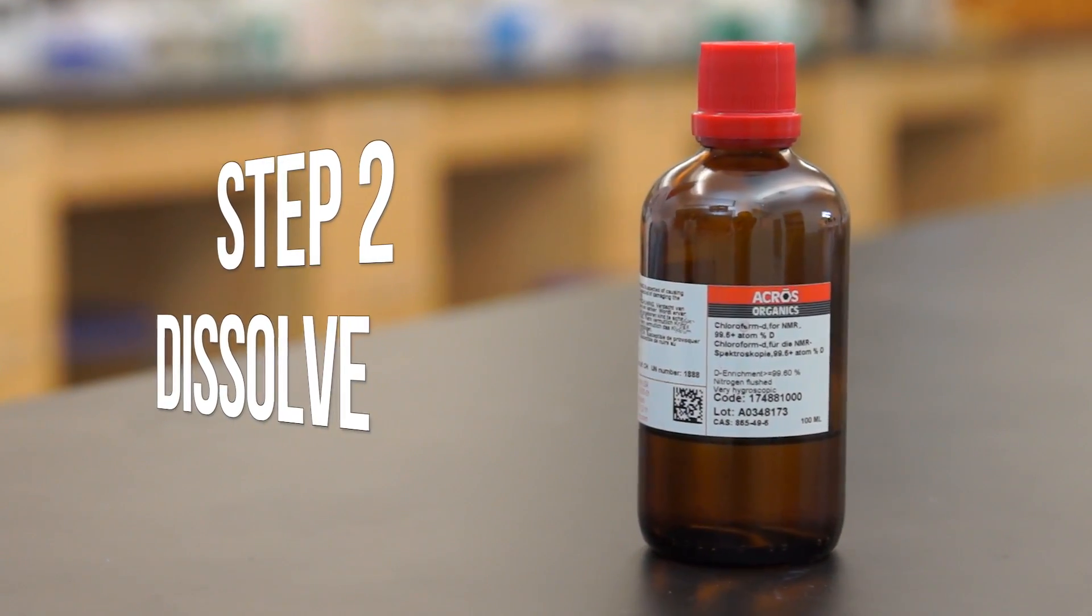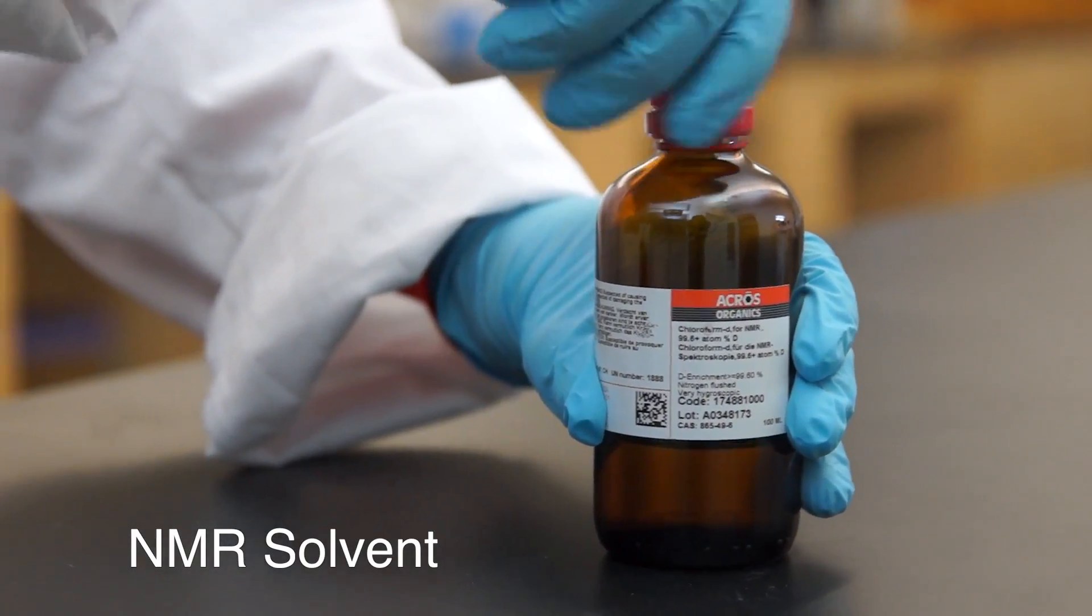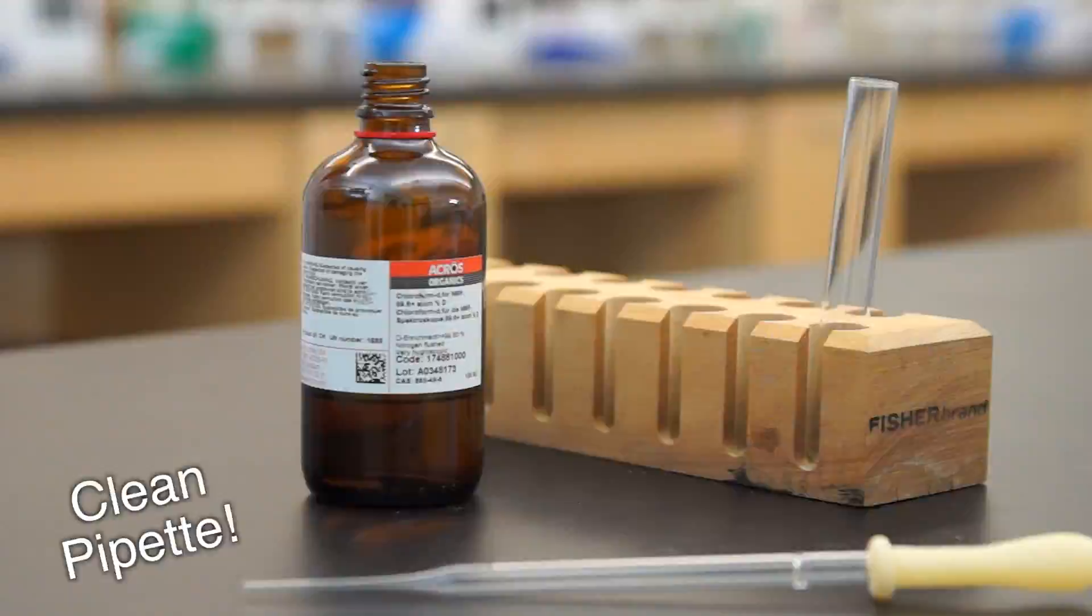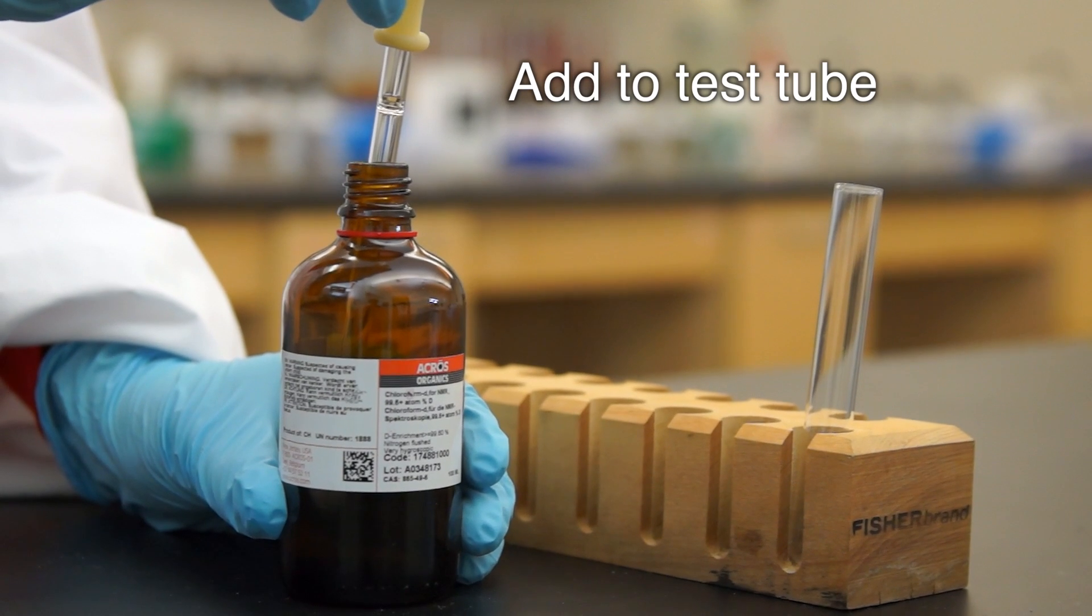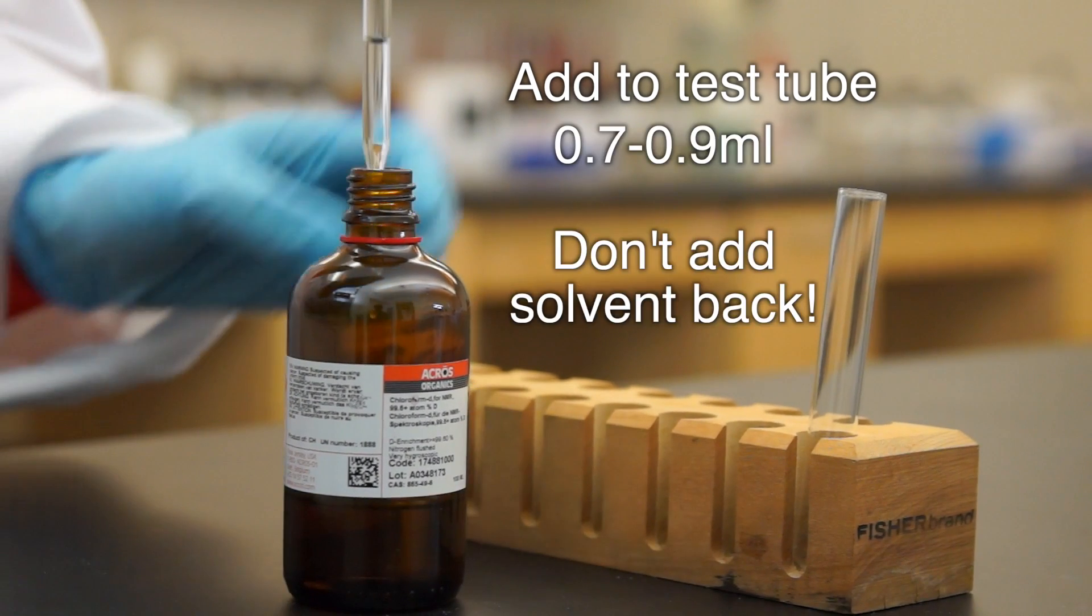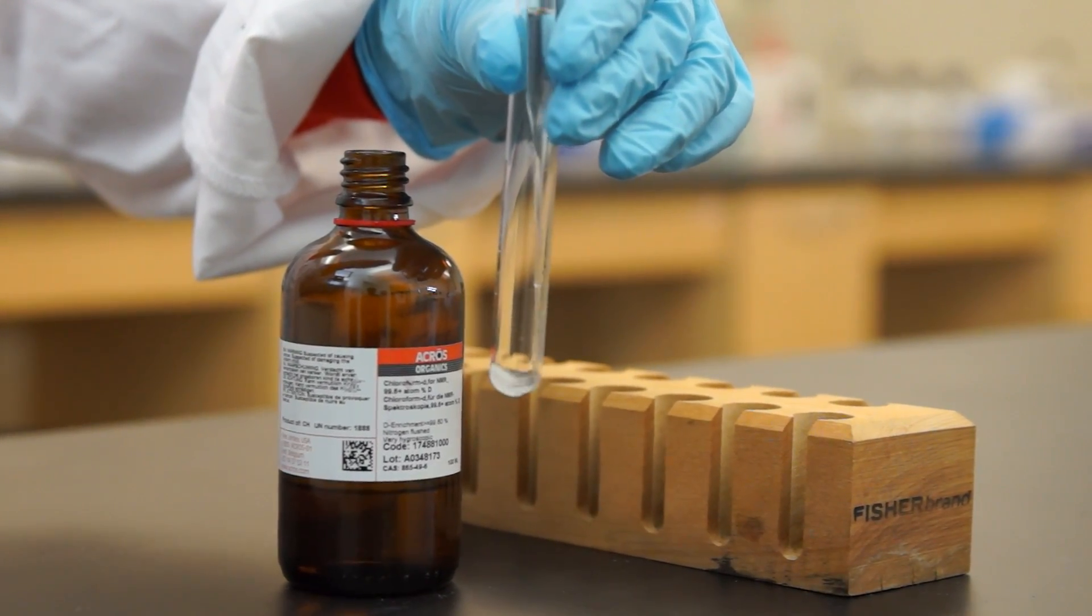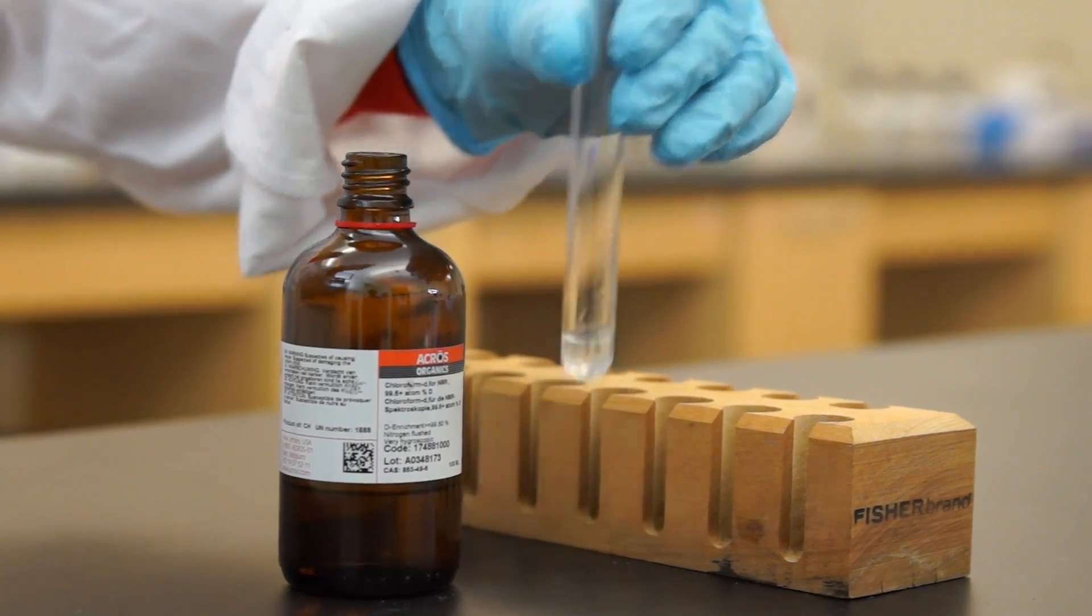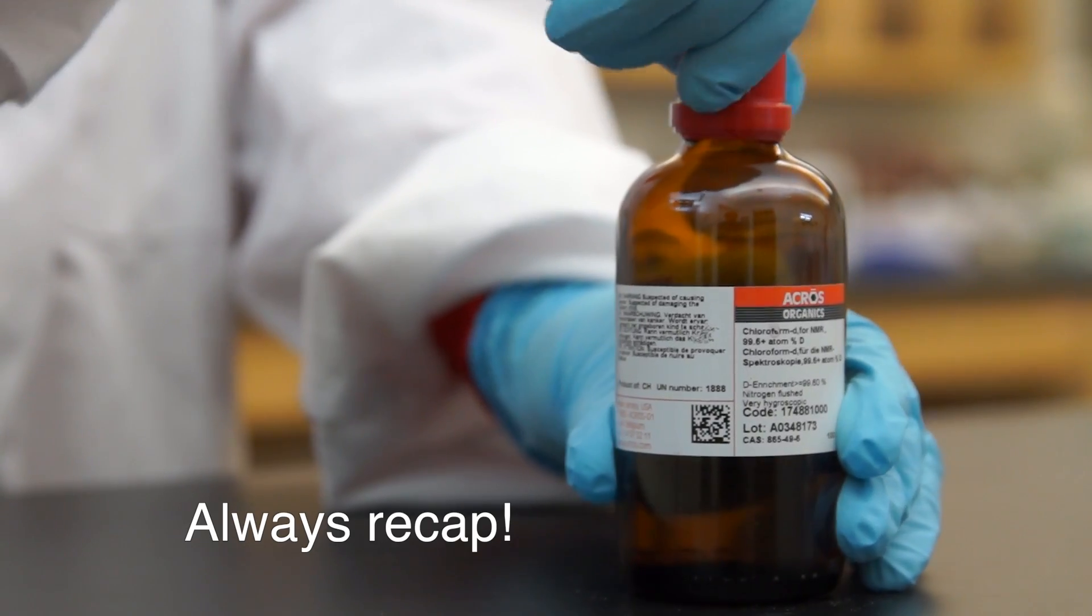Now, we're going to dissolve our sample. Uncap the NMR solvent and make sure you use a clean pipette to draw from it. Add about half a pipetteful, or about 0.7 to 0.9 ml of solvent to your sample. Remember, never add contaminated solvent back into the NMR solvent container. Always recap the NMR solvent container. Now, dissolve your sample by mixing it a little bit.